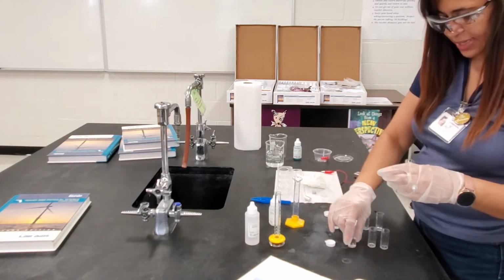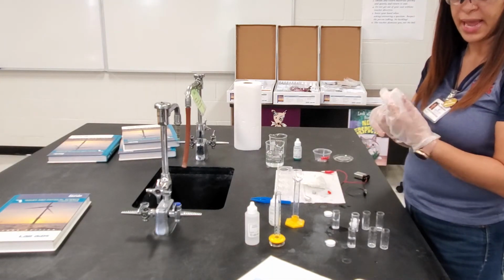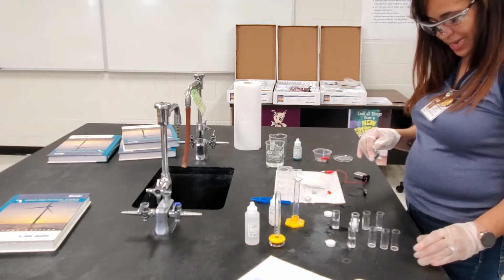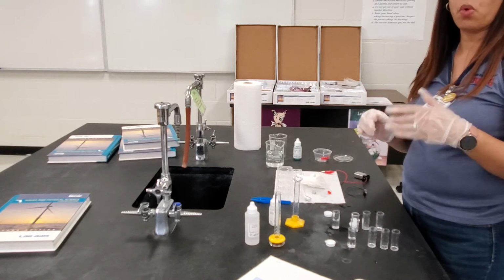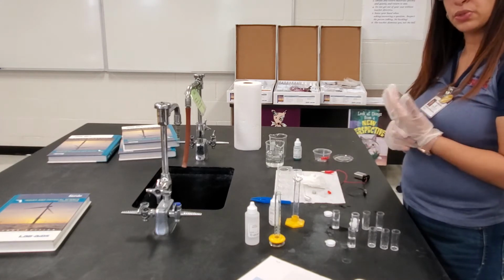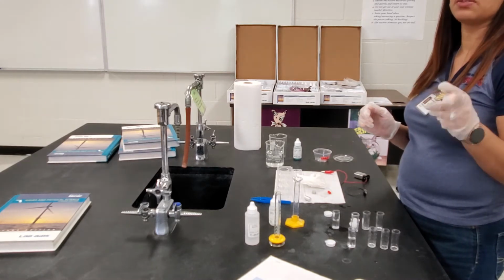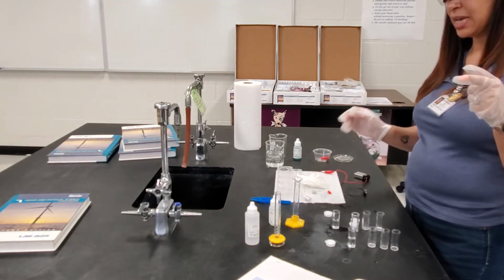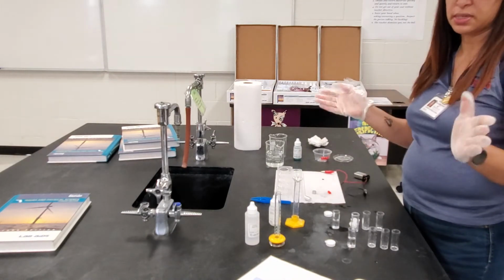So its density relative to the water is less than the water, whereas the two metal pieces, they were both greater than water, and its density relative to the ethanol is, its density is less than the water for the red tube, greater than the water for the two metal pieces, but the density relative to the ethanol for the red tube is less. Okay? Oh no, the density relative to ethanol is still greater for the red tube. It's less for the water, but greater for the red tube. I think that's what I said. That is correct. The metal pieces, density was greater regardless of the substance.